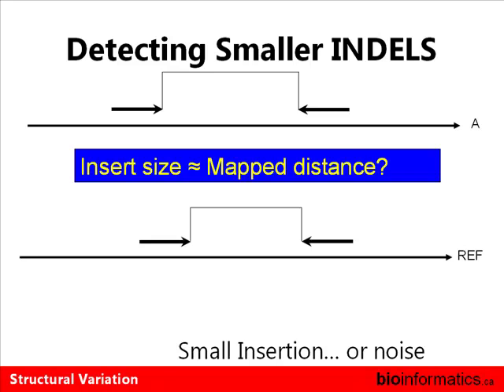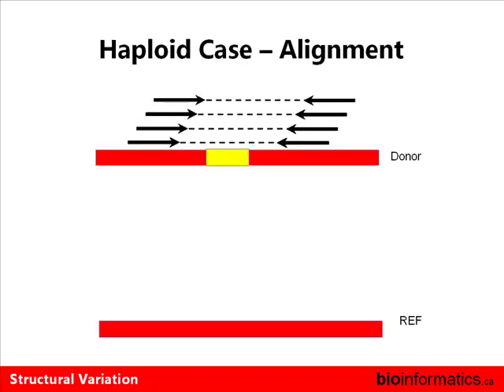How can we tell which one it is? Does anybody have ideas? No? Well, what data do we have? Mate pairs. So if we have a lot of evidence, then we should be able to do better. At least that's a hope.